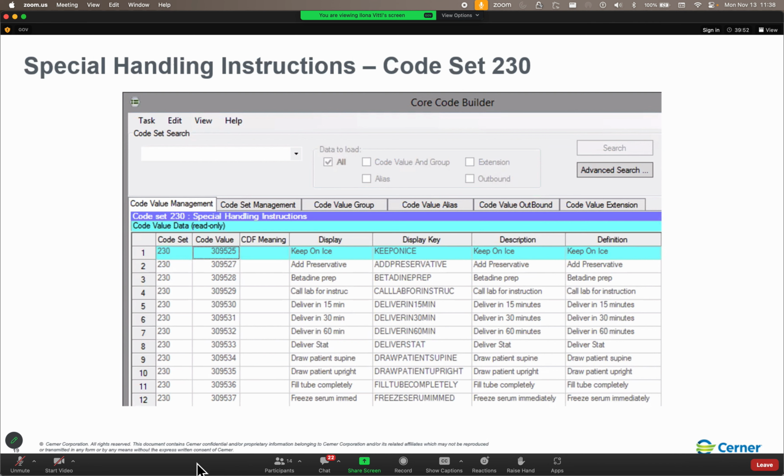Now, something to be aware of, both radiology and microbiology recommend that their orders each get their own accession number. So for radiology and microbiology, a new accession class is created for every orderable and specimen type combination, so that no micro order nets with any other micro order upon initially being ordered, which means this is going to be a pretty big list.